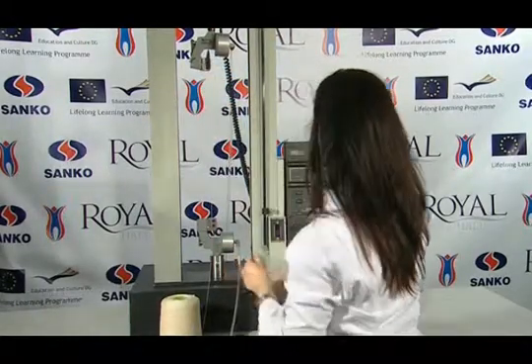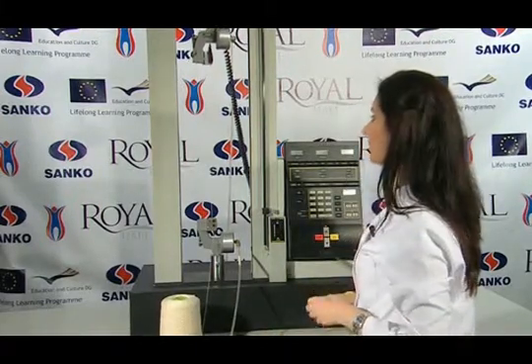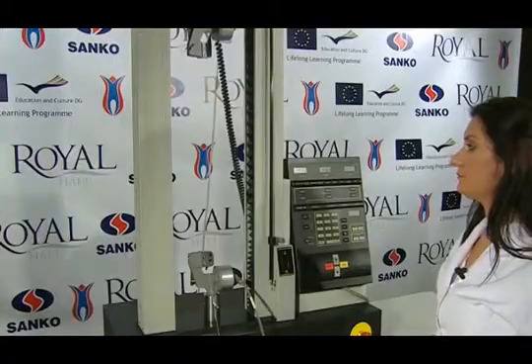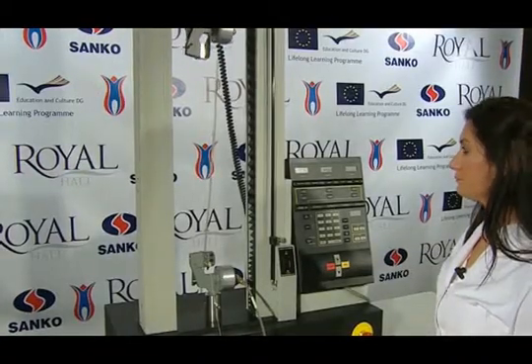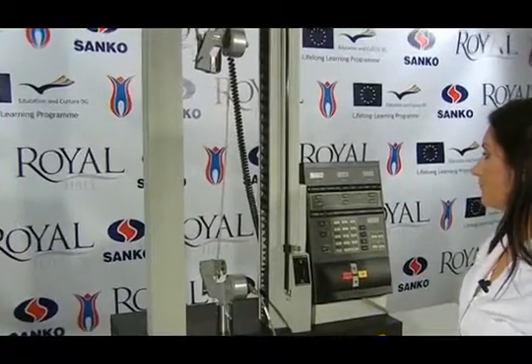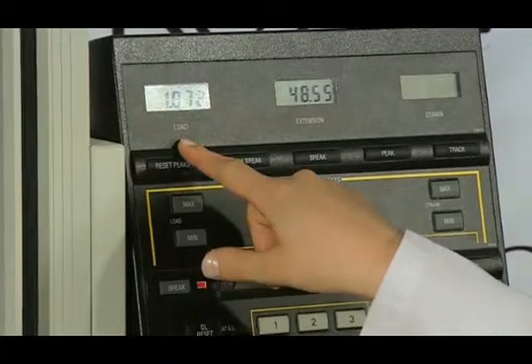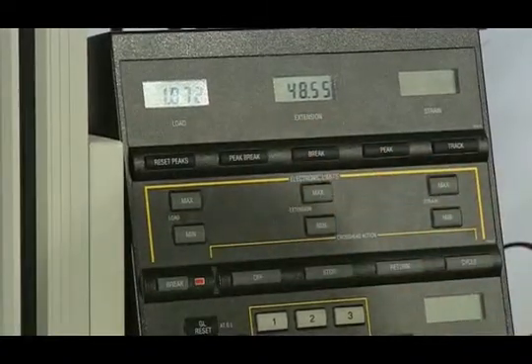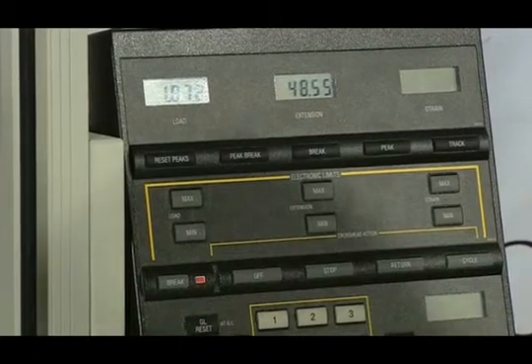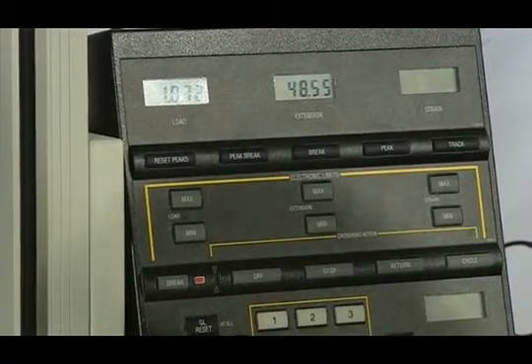The test is started by pressing the arrow button up. The test continues until the break-off happens. The elongation and strength values at the break-off moment are read on the device screen and registered on the related forms. After the testing process has been repeated with enough numbers of samples, the arithmetic mean and the standard deviation are taken as the result.